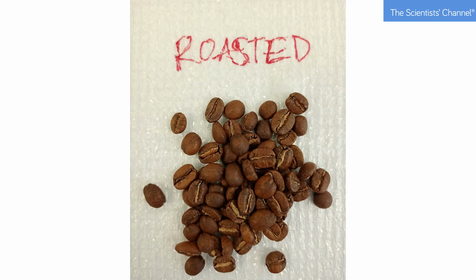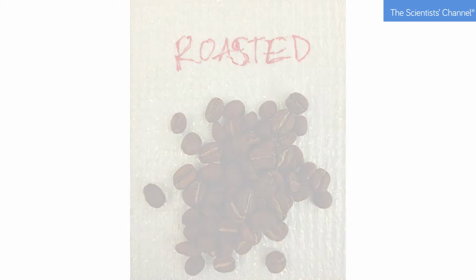The analysis of acrylamide in roasted coffee is a single-residue method, not only because of its particular structure, but due to the highly complex nature of its challenging matrix. The goal of the project was to combine relevant analytes in a simplified way, to include this SRM into an ethyl acetate-based multi-analyte workflow.